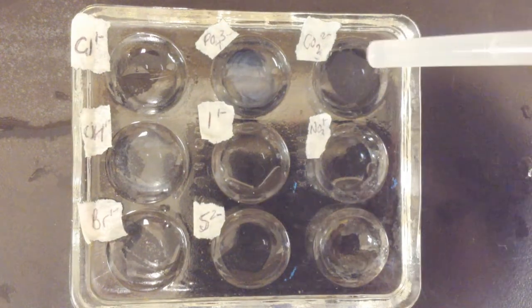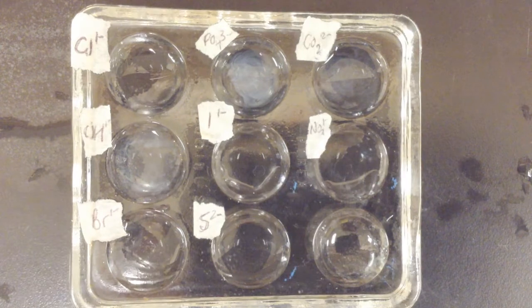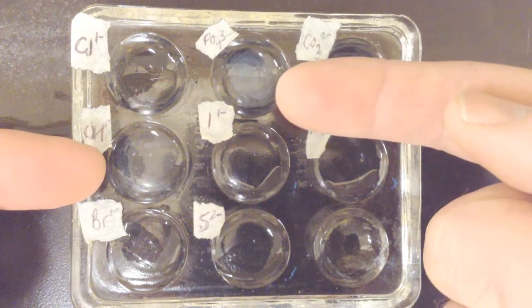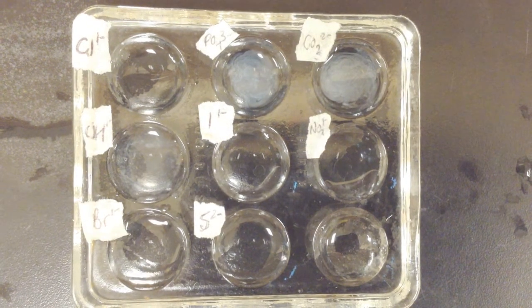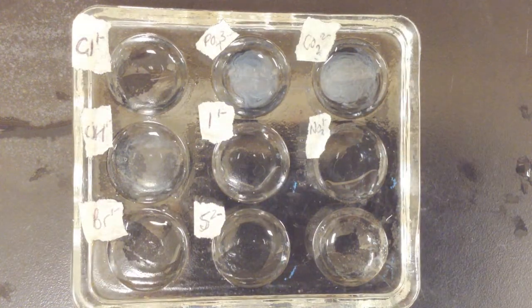Phosphate, carbonate, nitrate. It's hard to see, but really small precipitate formations in these two wells, with the phosphate and the hydroxide. That's been magnesium 2+.